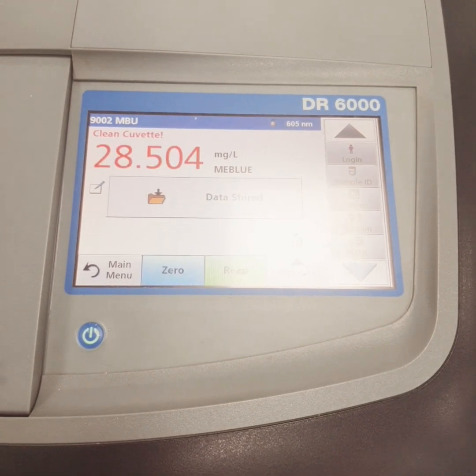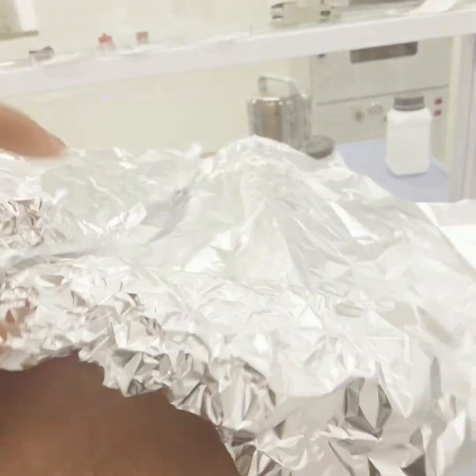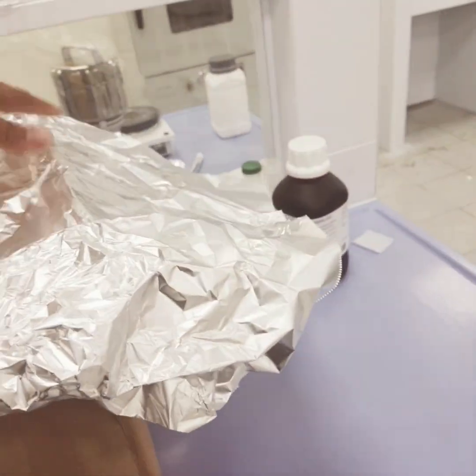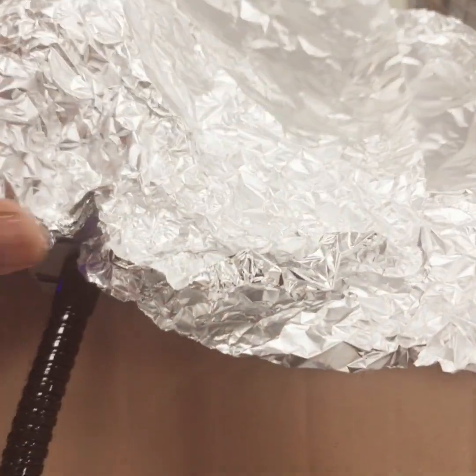On the lamp and run it for few hours and then we will check the final concentration.